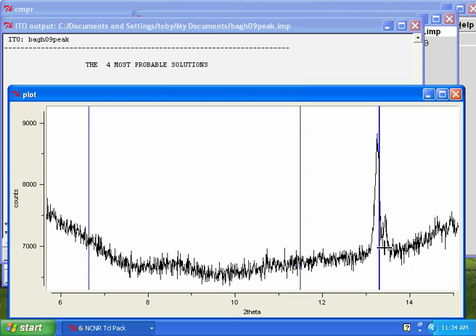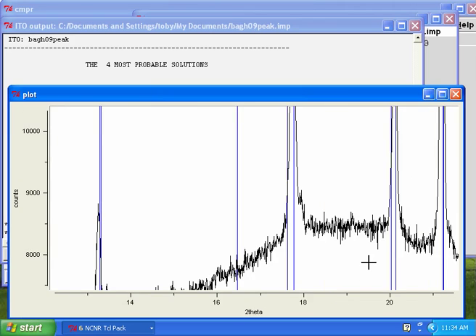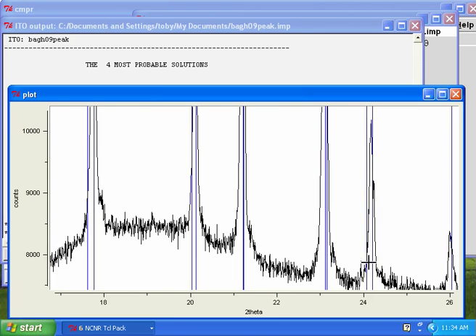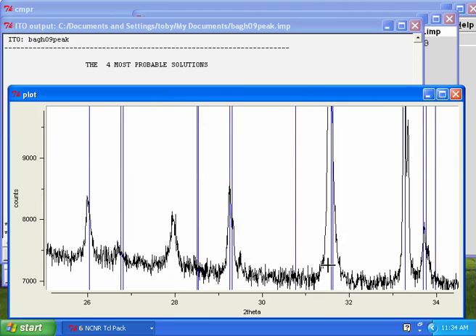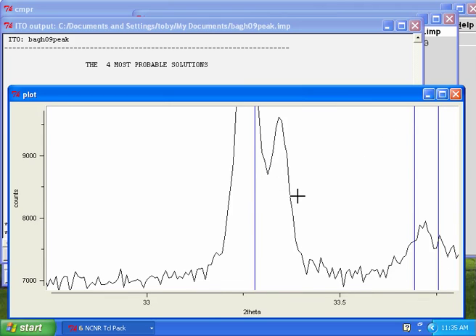We see two peaks, and this is clearly not a K-alpha 1, K-alpha 2 splitting, showing up where we see only one peak at low angle. And using the arrow keys, we can scan along, and we see that, in general, this lattice is doing a pretty good job of indexing the peaks, except for that one right there. We have not indexed that one at all. So, come to the conclusion, here we've got one line where, let's zoom in for a second, where there are clearly two.